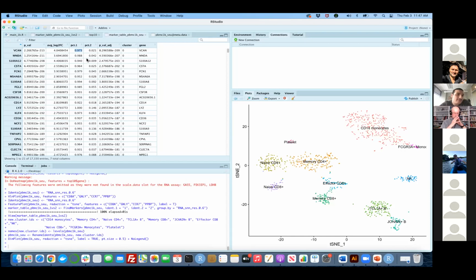Yeah, it's telling you that the mean expression on all other clusters is so low as opposed to the mean expression of this gene in that particular cluster. Okay. So that's by the way, Bruce, you actually asked a really good question. The find all markers function has a default test, which you probably know.